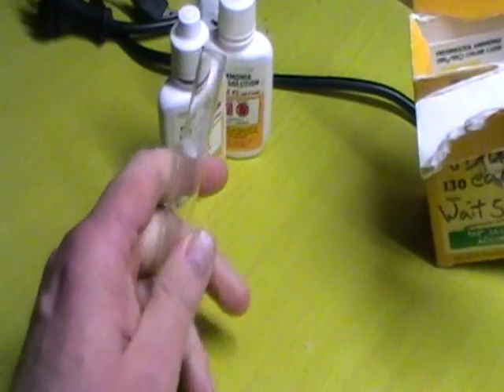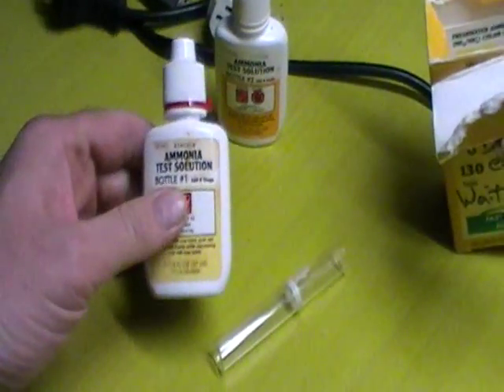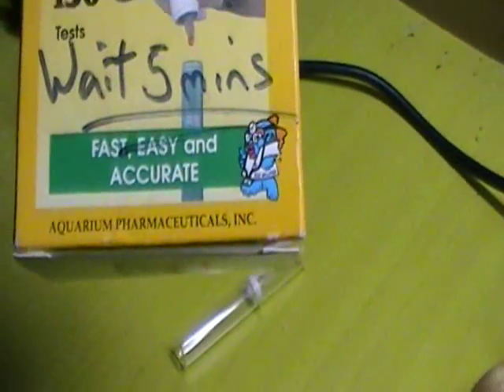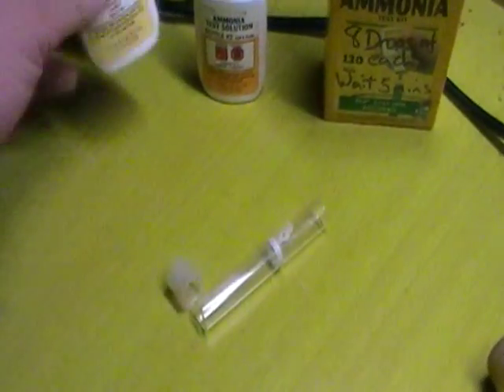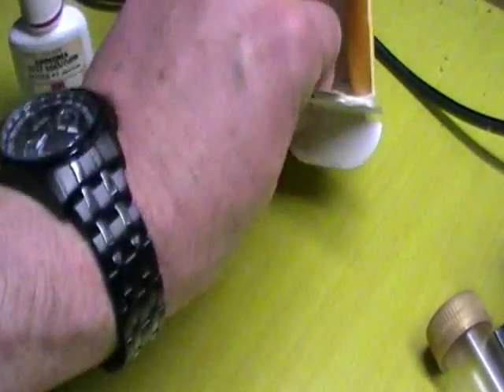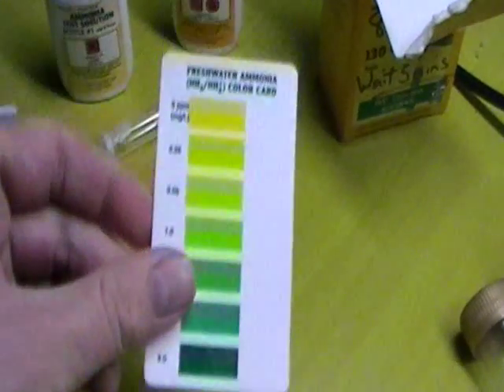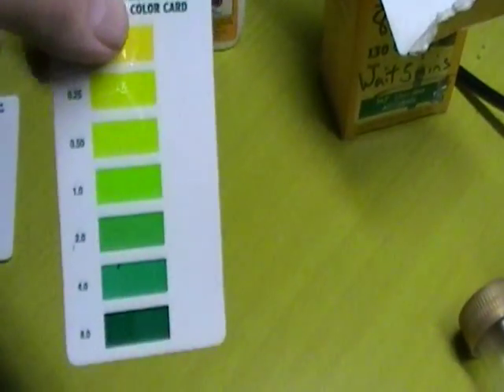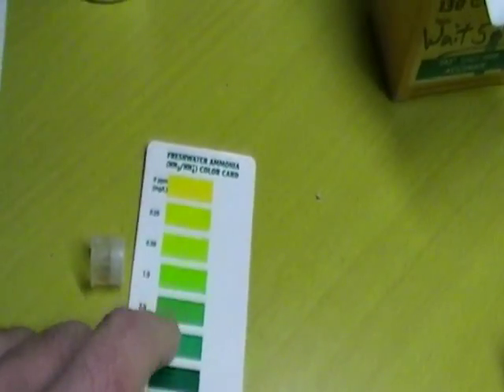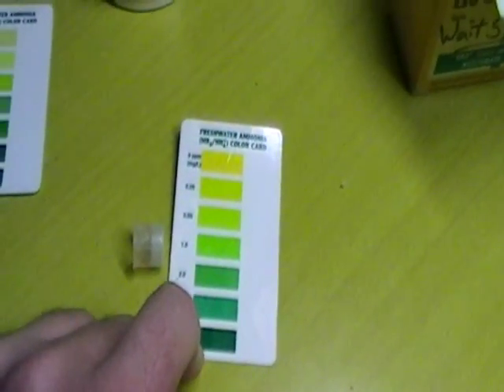So what I do is put eight drops of each of these two test bottles — this brand, Aquarium Pharmaceuticals — eight drops of each into here, shake it up, and you wait five minutes for the results. Then you read the color off this freshwater card — important to use the right card, not the saltwater one — and you compare the color in this vial against that card. It gives you a reading of how much ammonia is in the water.